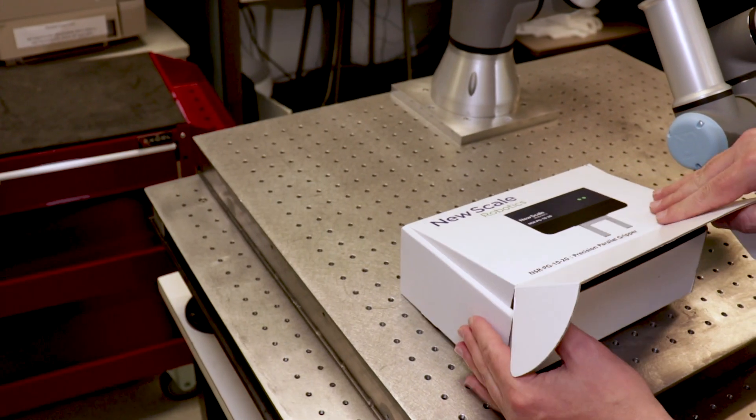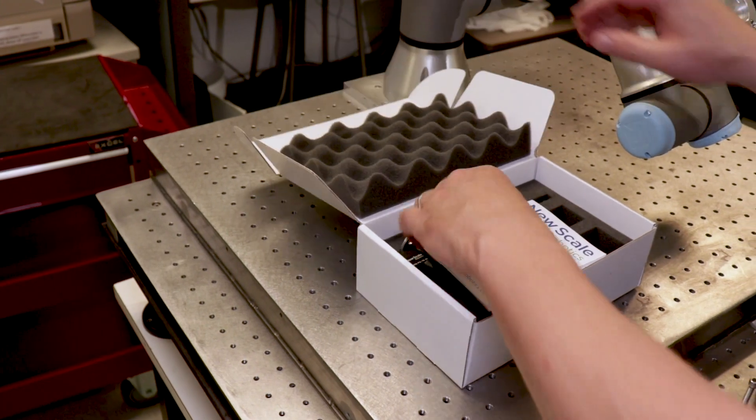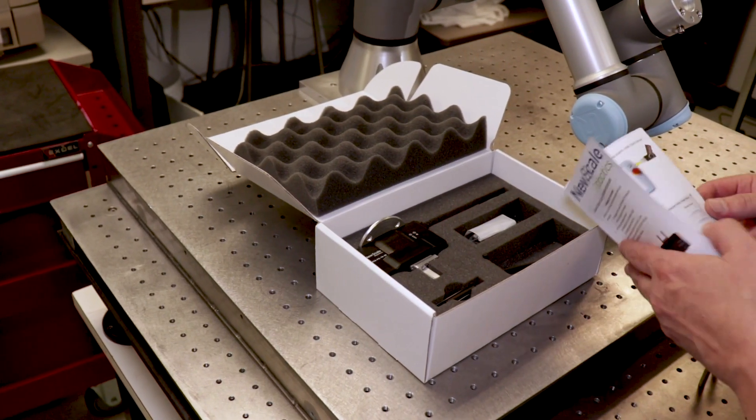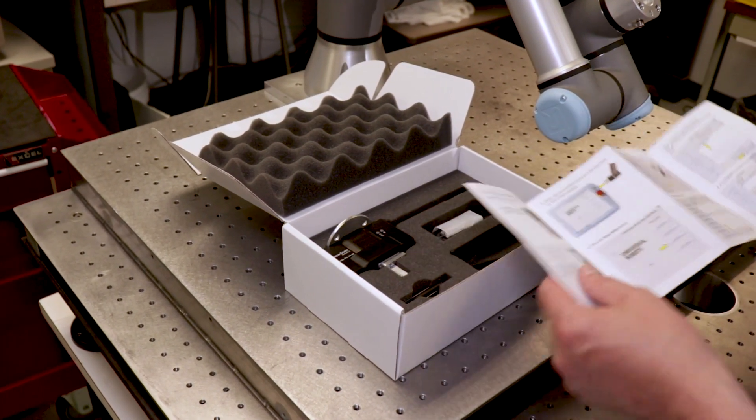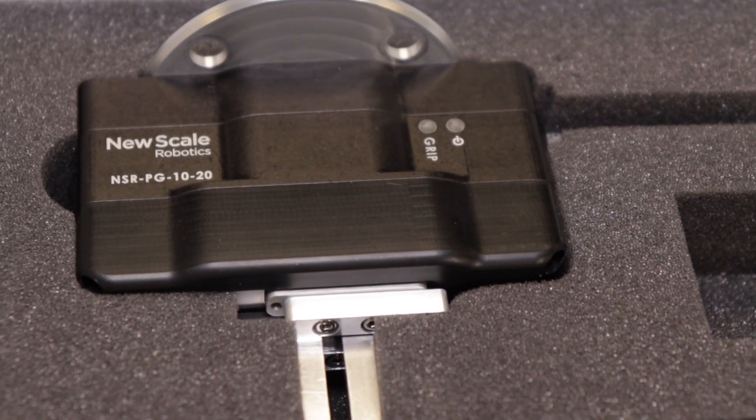You'll receive your gripper ready to use with everything needed for assembly right in the box. Using our quick start guide, you can have your gripper up and running within minutes.